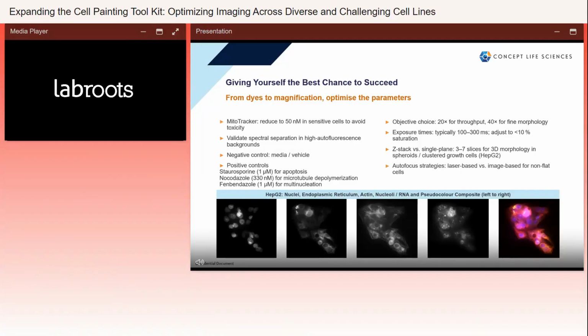And earlier I mentioned that growth morphology can make imaging difficult. For instance, the HepG2 cell line loves to grow in clusters and on top of one another. Now, this makes for a very happy group of cells, but a very tricky thing to image. And to counter this problem, you can employ some Z stacking protocols. This is where you align the Z plane where you would image the monolayer as normal, and then instruct the software to also image a set amount of microns both above and below that location to build up a composite image that can be tens of microns thick.